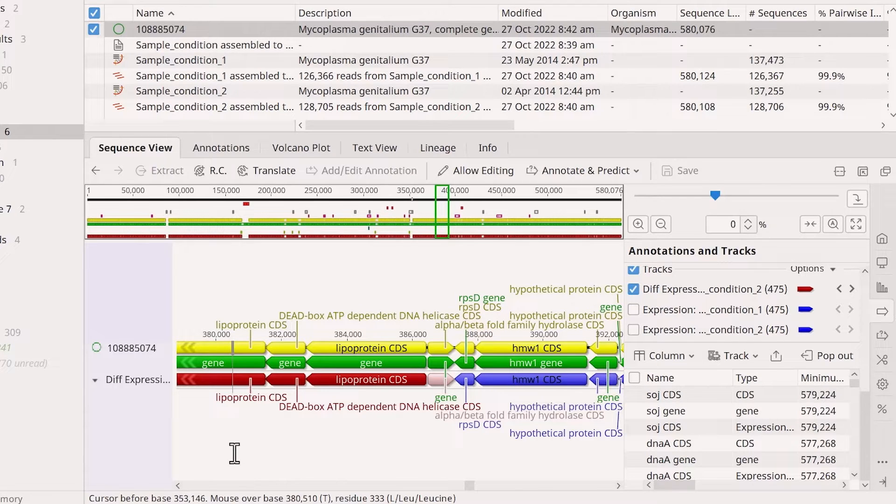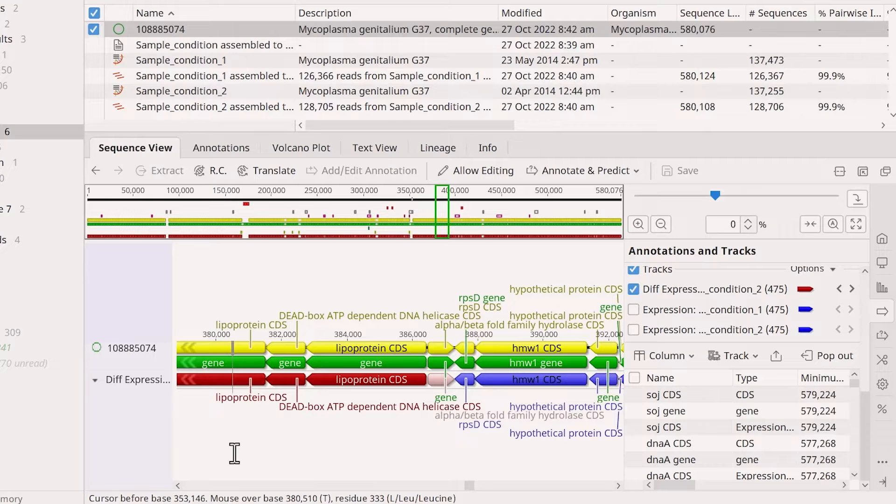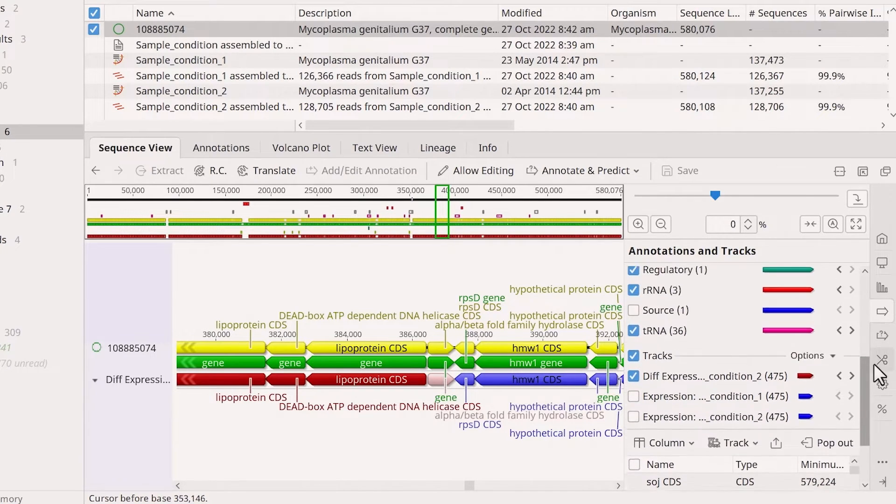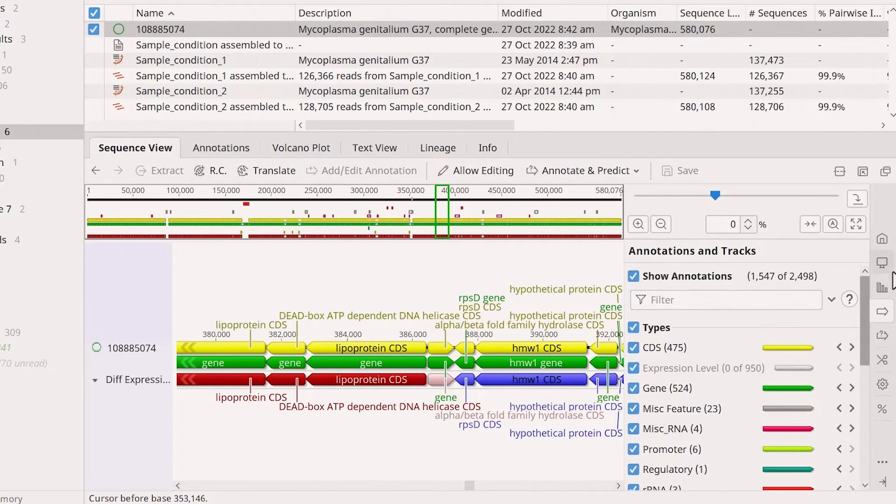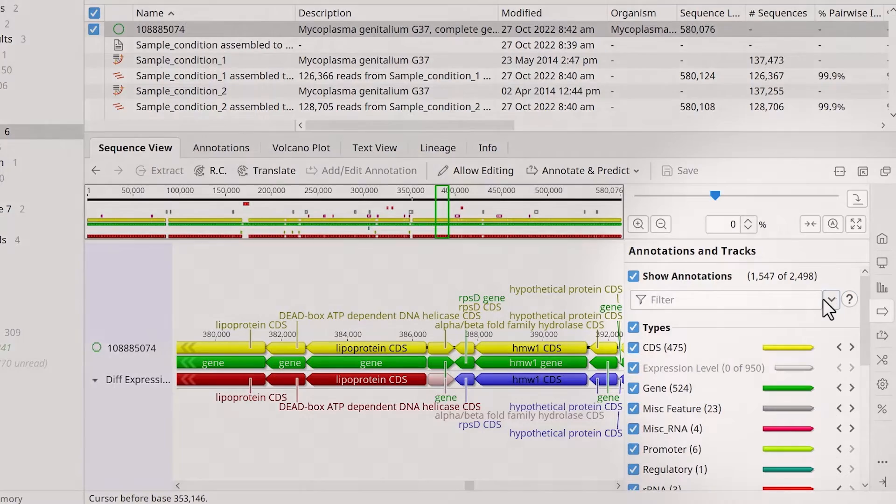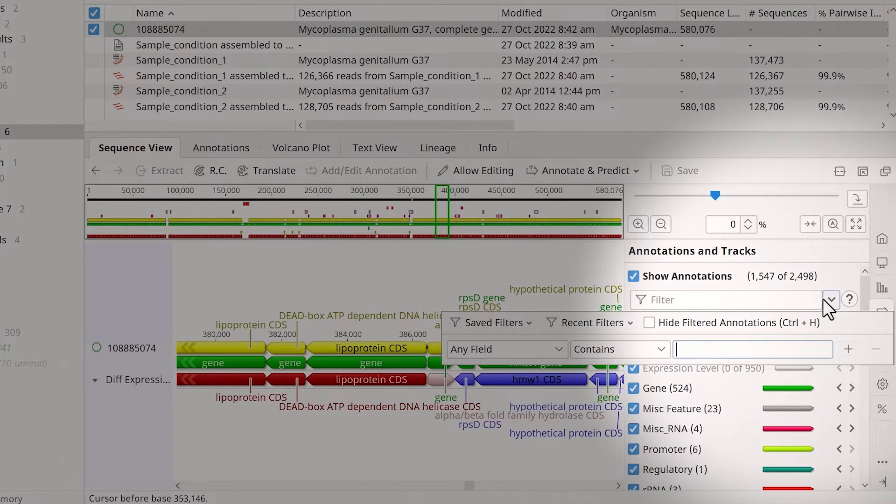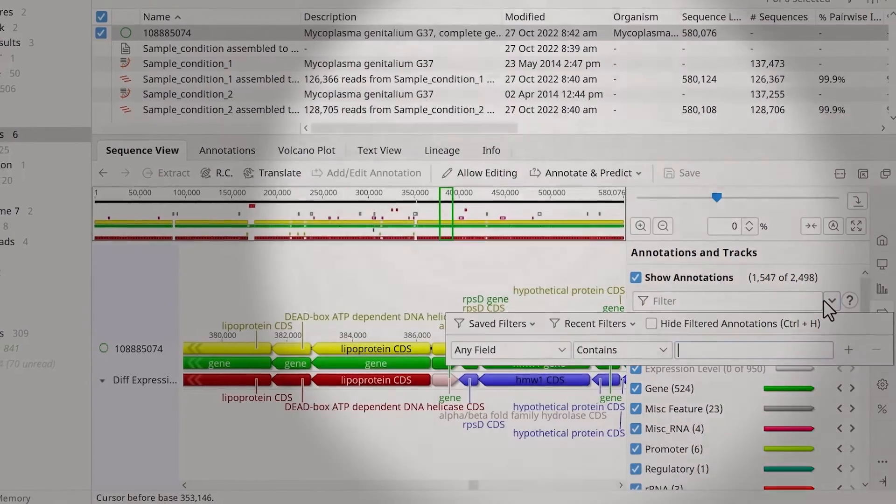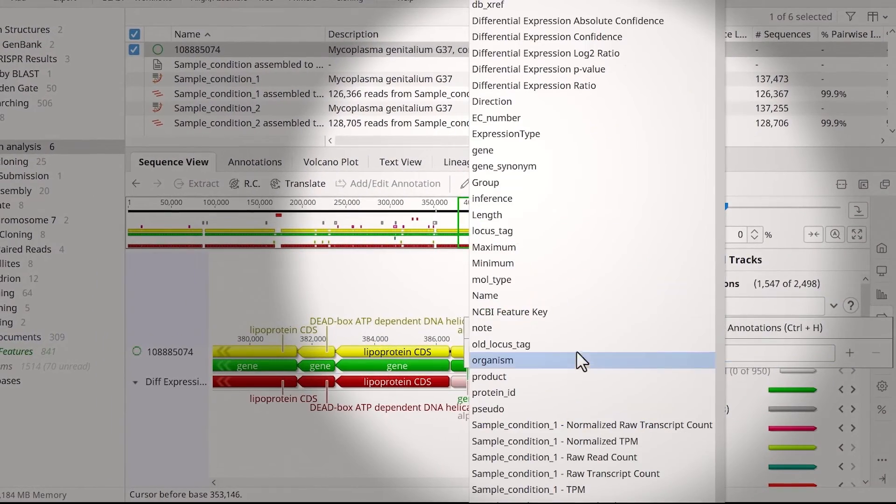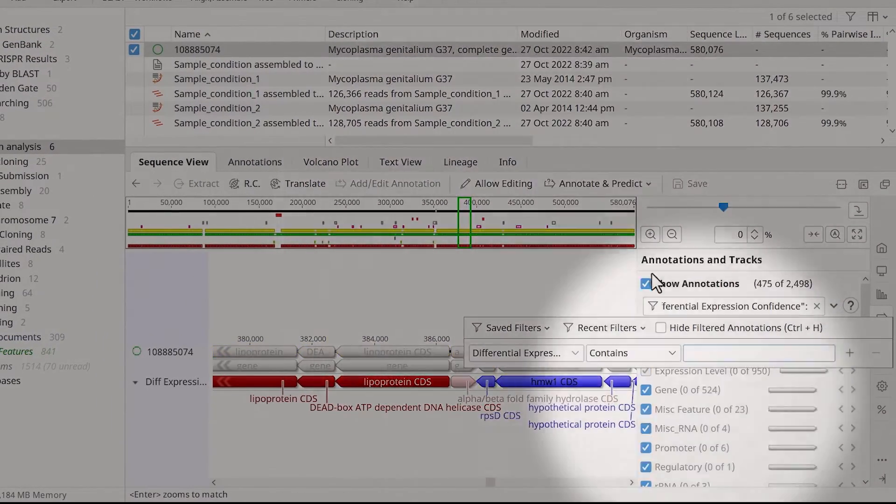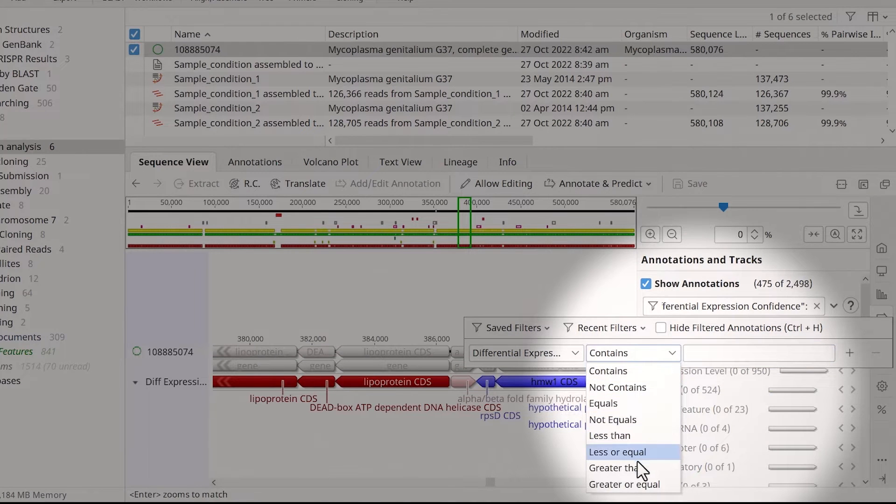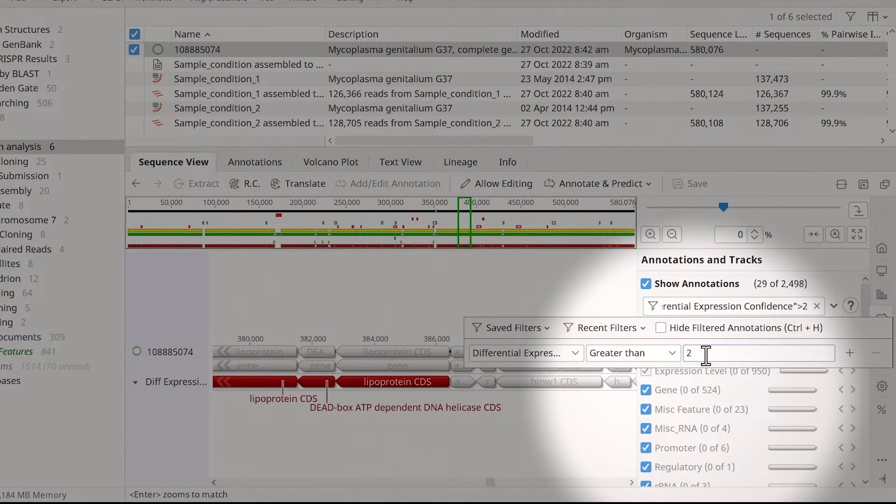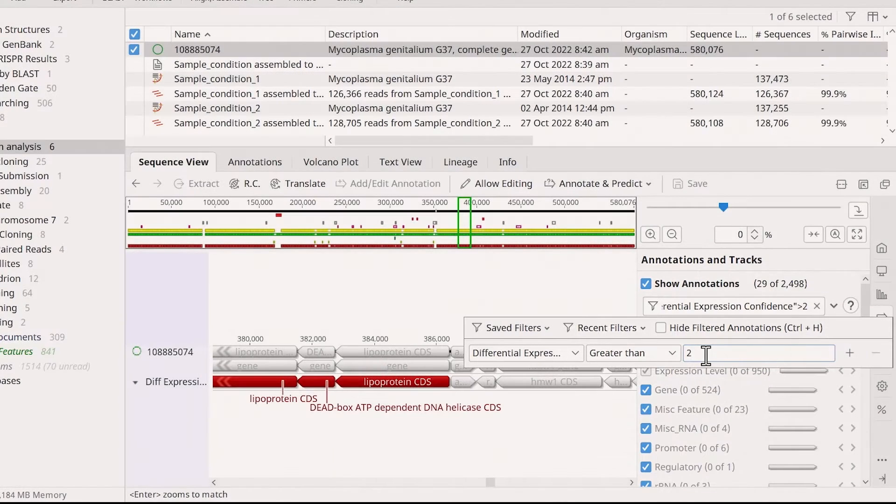To filter the results, for example, showing only those genes significantly overexpressed in sample 2 compared to sample 1, select the down arrow next to the filters option in the annotations and tracks view. Change the field to differential expression confidence, then adjust the values to greater than 2.